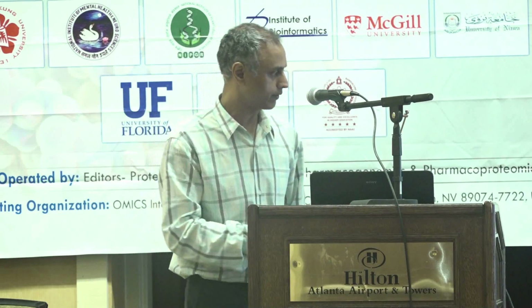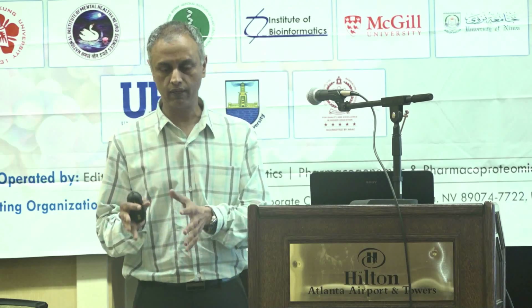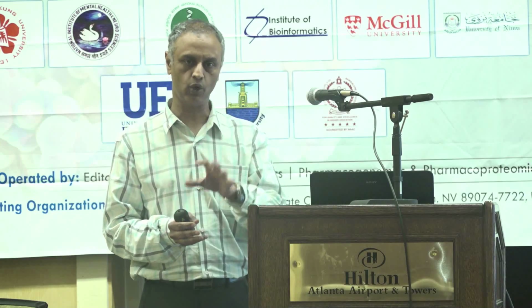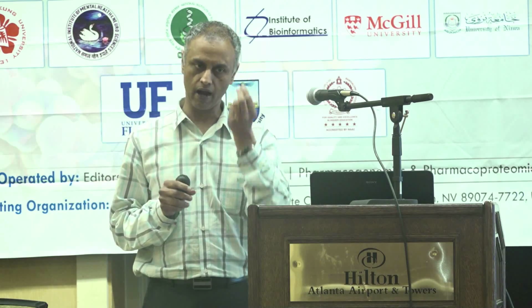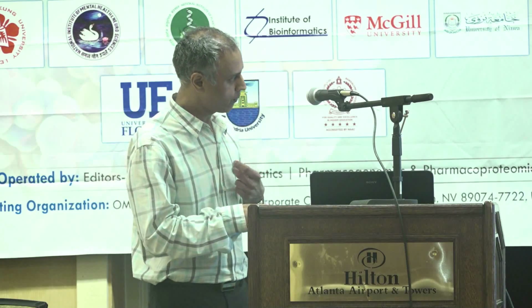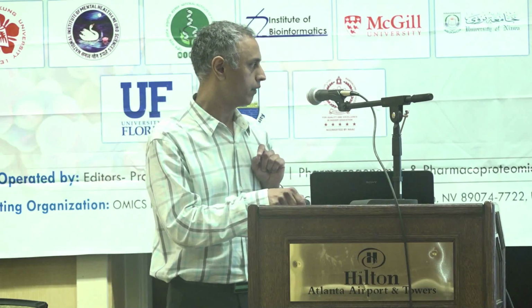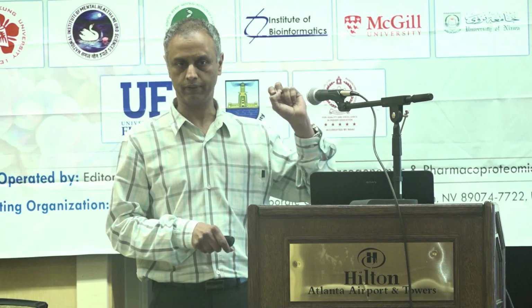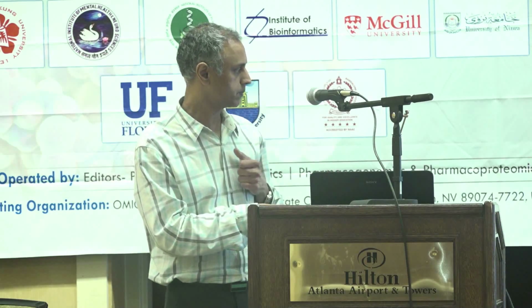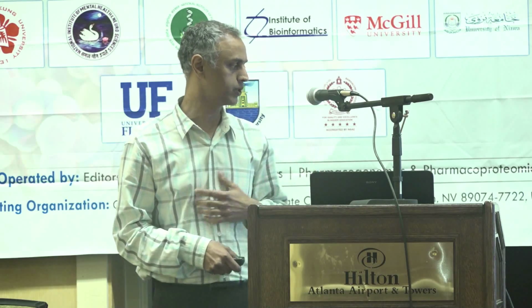And so finally, going into the future, this is my last slide, what I've shown you still is the easy space for all of this to operate in, for either genomics or proteomics, because we have isolates. We have this material obtained from cultures. We are now pushing the technology to do it directly from specimens. This was done from cultures. We want to go to specimens, and the specimens could be blood culture, CSF, sputum, pus, bronchoalveolar lavage fluid, urine.